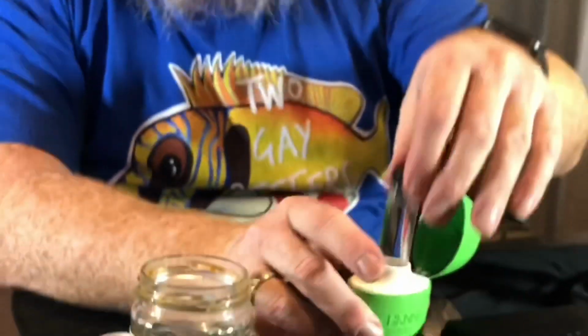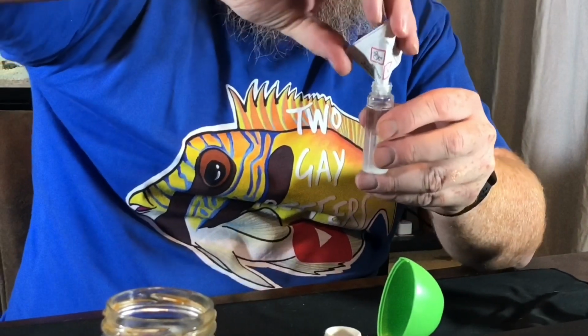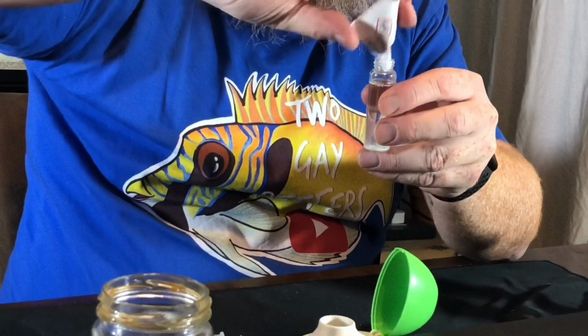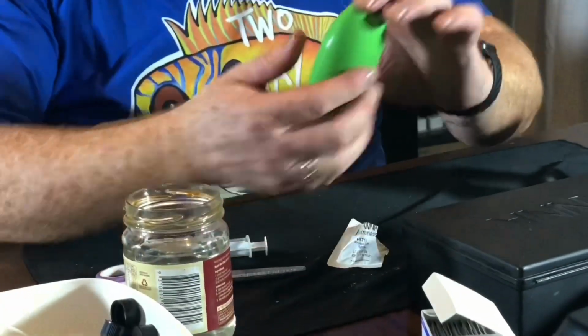The checker is now saying C2, which means I take out the vial, I pour in the reagent, make sure it all goes in there, make sure there's none left over. Put the lid back on and give it a shake for 2 minutes until the powder is completely dissolved. All right, I've shaken that for about a minute or so and it's all nice and clear now. Just give it a tap to get rid of any little bubbles in there. Put it back in, close it up.